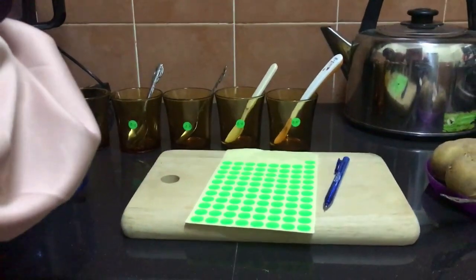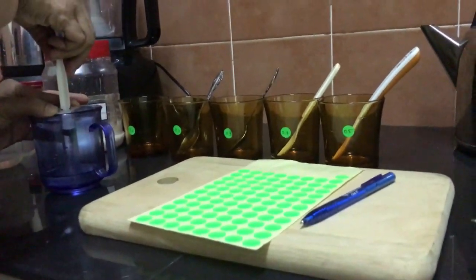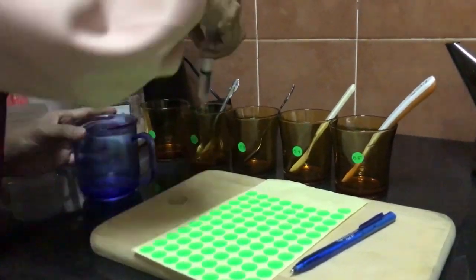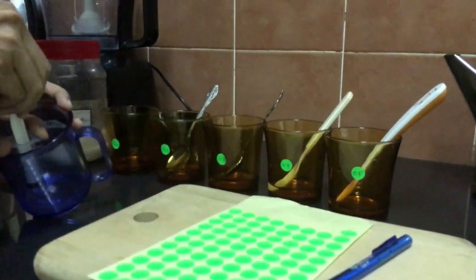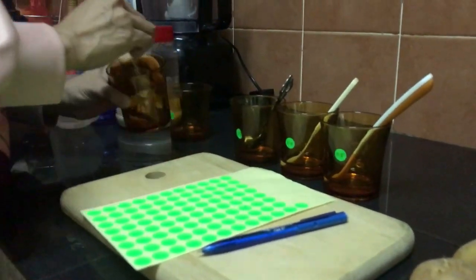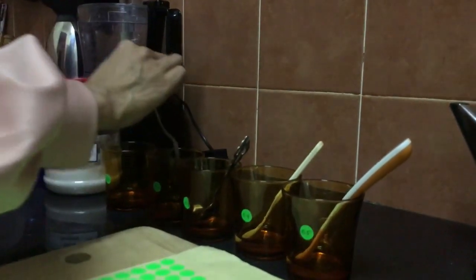So for the first one, you need to add 18 ml of tap water, to make sure that the solution mixes well to make it homogeneous.